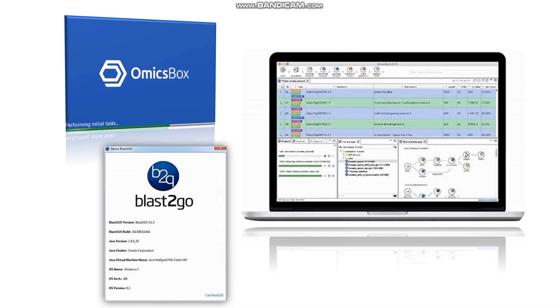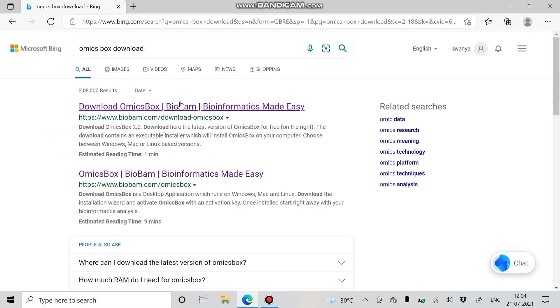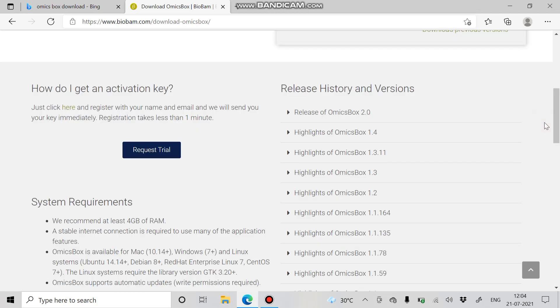Blast2Go is one of the functional annotation tools in OmicsBox, establishing annotations for functional genomic studies, especially non-model organism research. For downloading OmicsBox, search by text by clicking OmicsBox download and enter the first link. Once downloaded, proceed with the installation process. OmicsBox is a commercial application, so we can proceed with the 7-day free trial by clicking request trial and entering the necessary information.